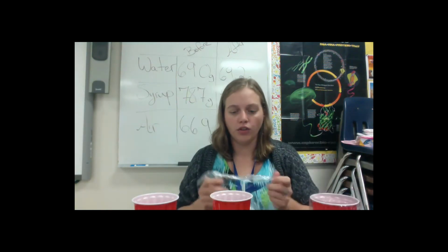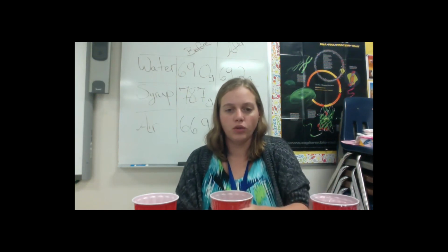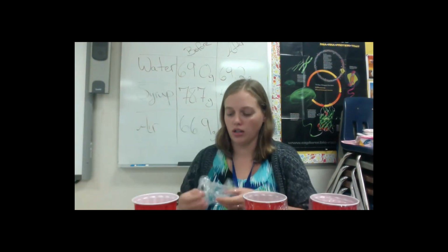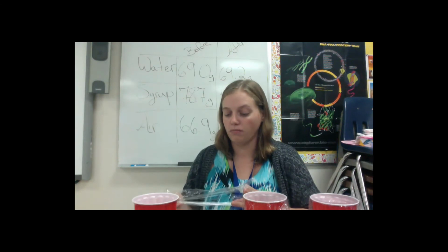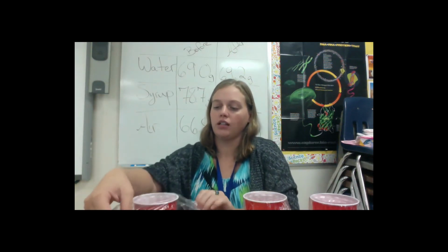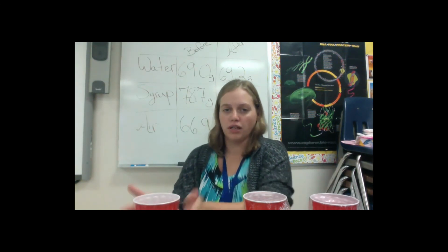So now I'm going to cover my cups just like I did yesterday, and we'll check them again in 24 hours, and we will find out if these membranes are destroyed, if their properties have been destroyed, or if we can in fact change the masses of these eggs and reverse their appearances.